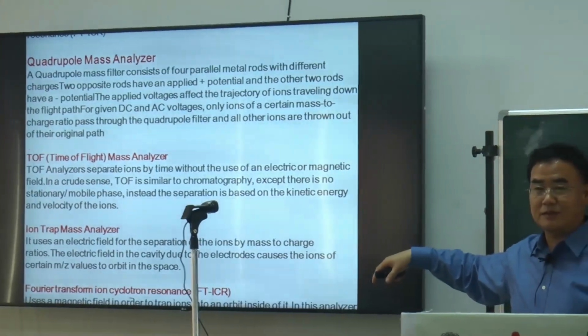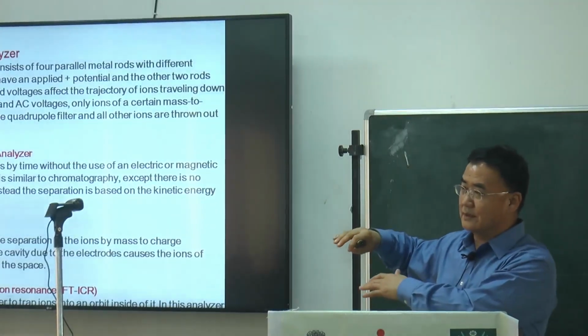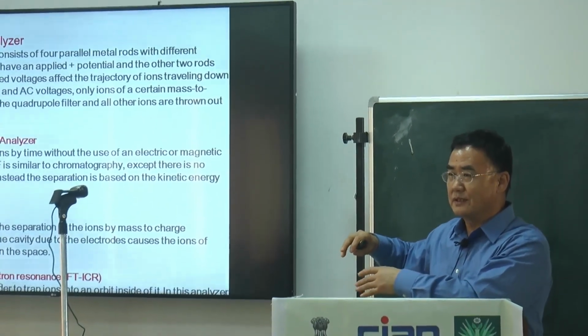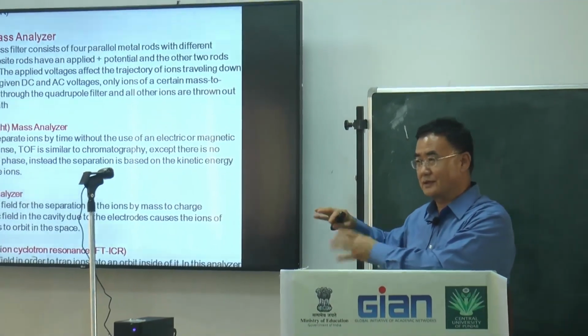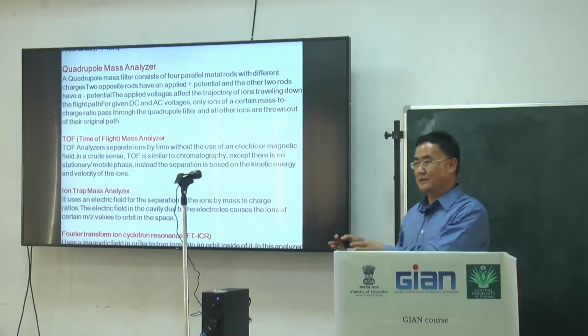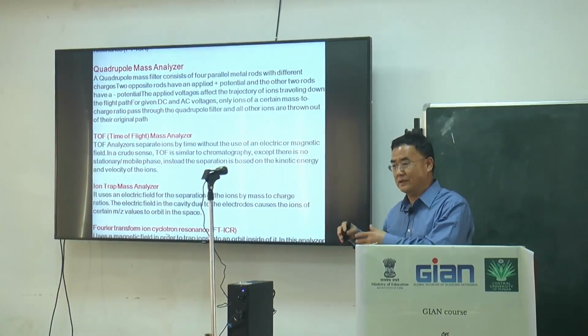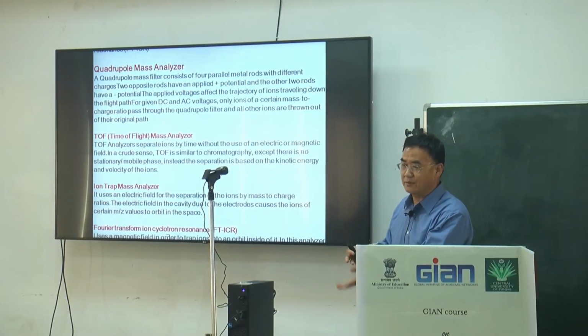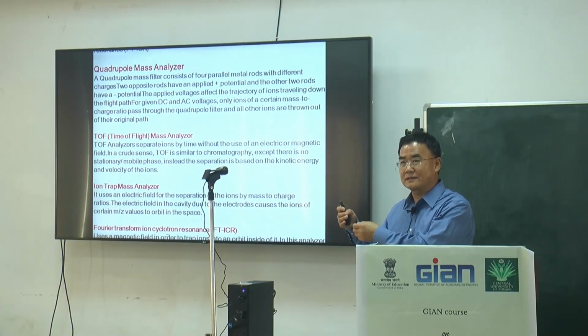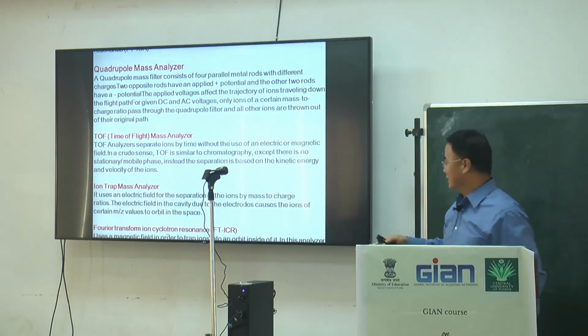Today, after we have a basic understanding of LCMS and GCMS, how they analyze and separate those molecules, we will step by step get into data analysis, how to analyze those ion peaks, and then interpret the data into the real metabolite results.